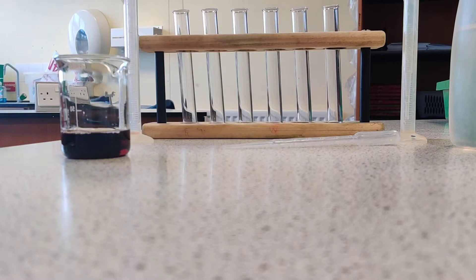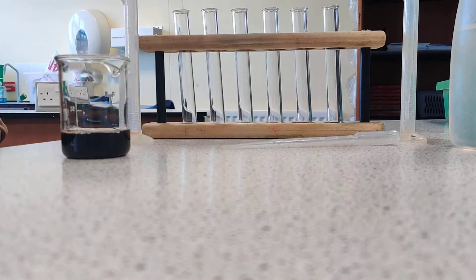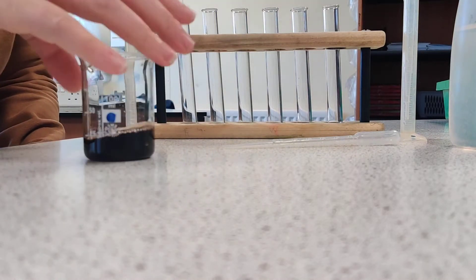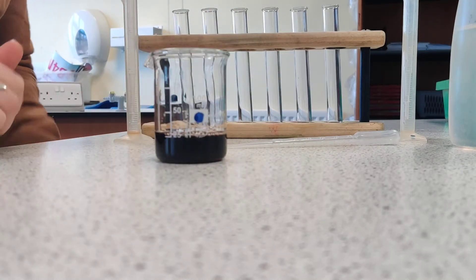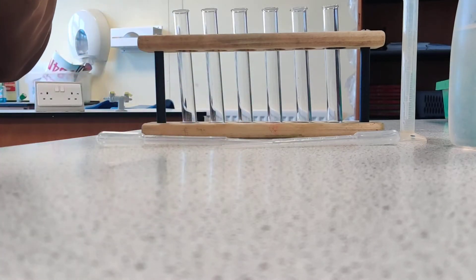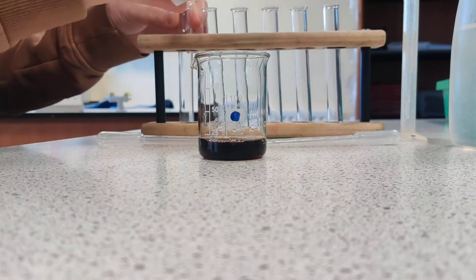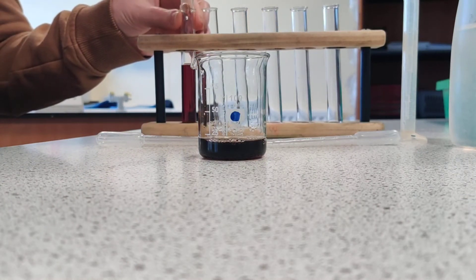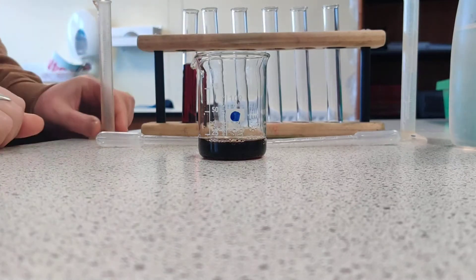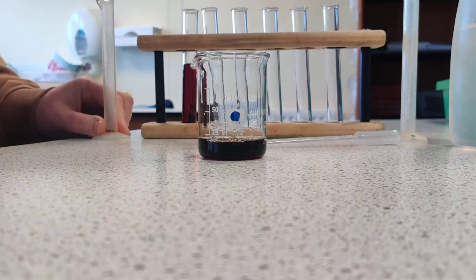The first thing we need to do for colourimetry is to make up something called a serial dilution using the 100% solution of the blackcurrant juice. I'm going to measure out using a measuring cylinder and a pipette 10 cubic centimetres — that's my 100%. I'm now going to dilute it by half.